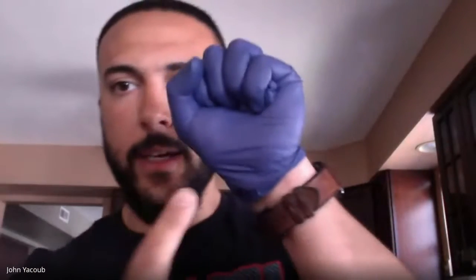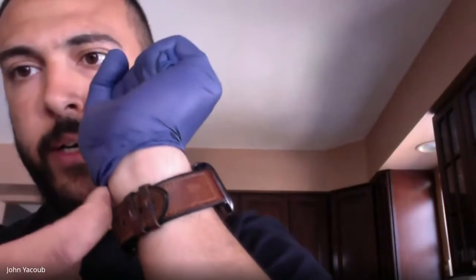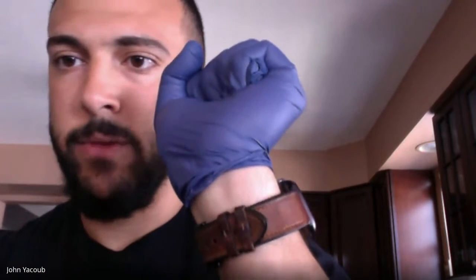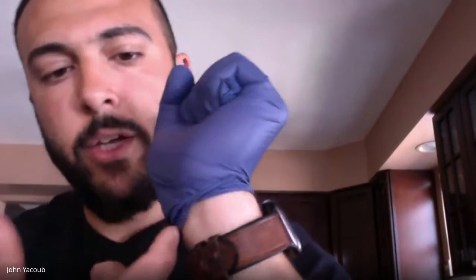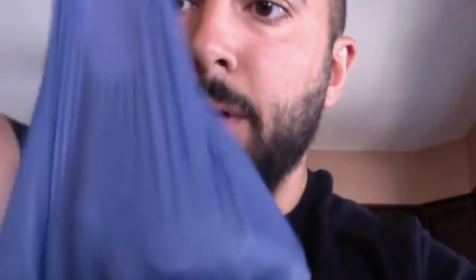Now, how do you take the second glove off? Well, right at your wrist, you just poke your finger right underneath and grab the inside of the glove — the part that's not making any contact with any surfaces of any kind. You hook your finger right underneath and pull it up over the ball of glove that was in your other hand. And now you've created yourself a nice little baggie and you can just toss it right in the garbage. That way you don't make any contact with your skin and you've completely disposed of the gloves properly.